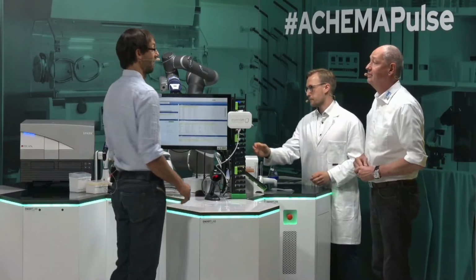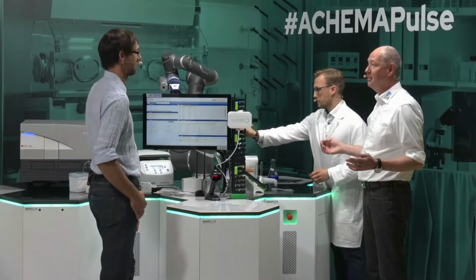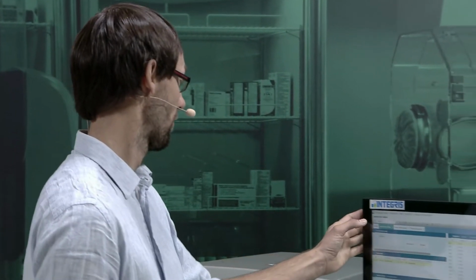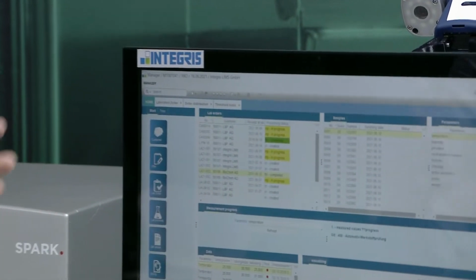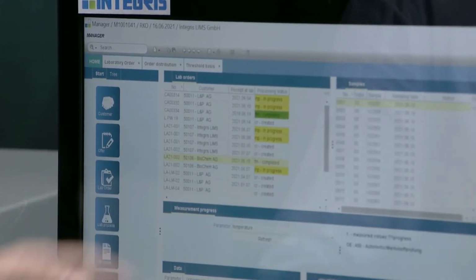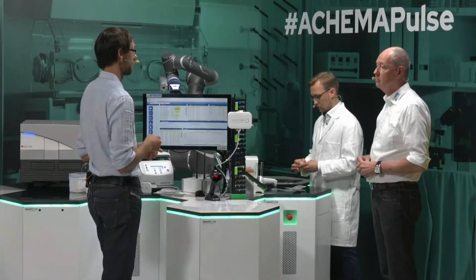Hi, Robert. Hi, Michael. We have to check the ELIMS and the transferred data. Please, can you show me the entries and results? Of course. First, we have to check the process or the status of the order. So let's switch to the dashboard of ELIMS, and that's a dashboard where you can see a gadget with all the lab orders of today. And as you can see here, it's completed. That means all the analytical measurements are made, and we can switch to create the report.